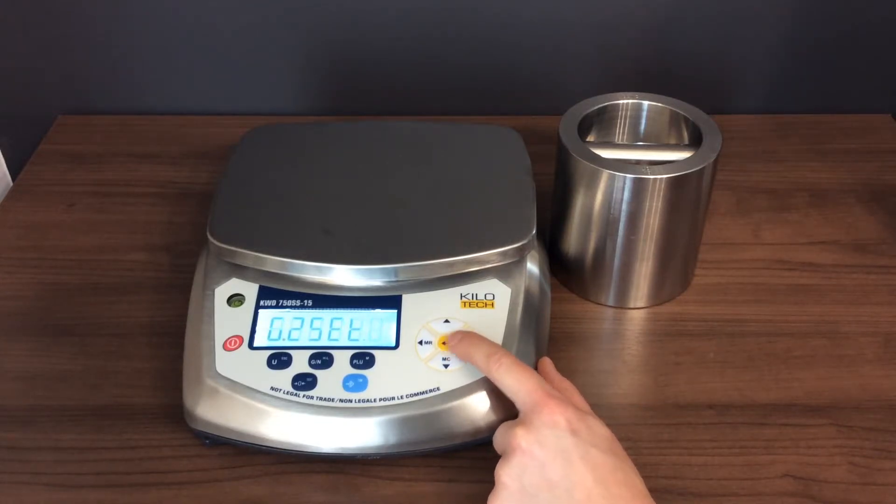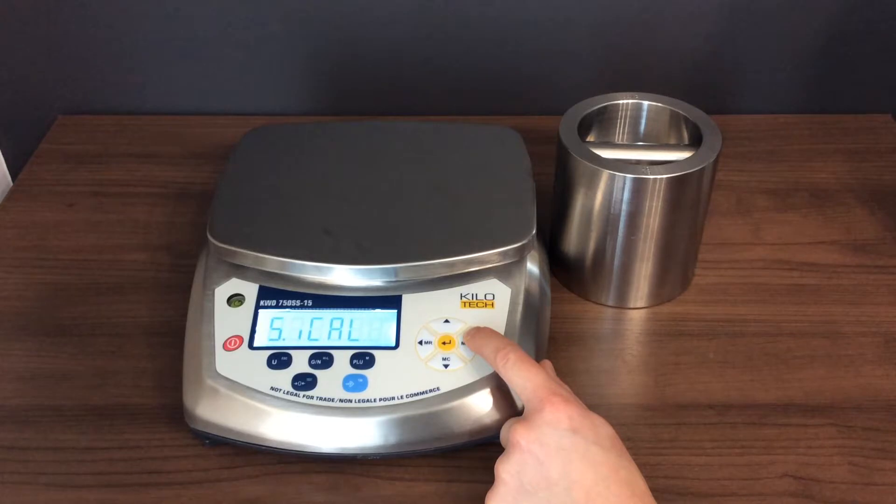Press the right arrow until the LCD displays SICAL. Press ENTER. The scale calibrates its zero point and shows SI01.